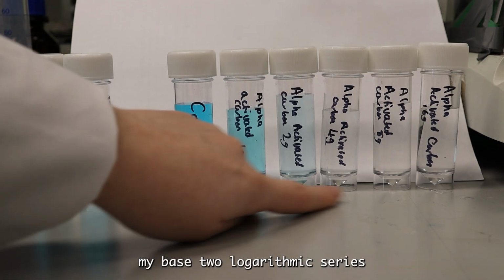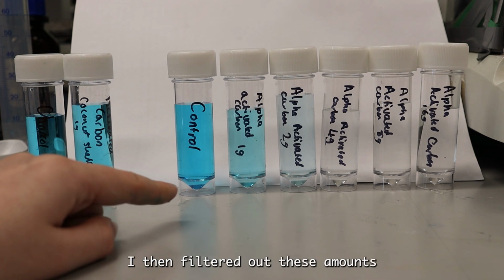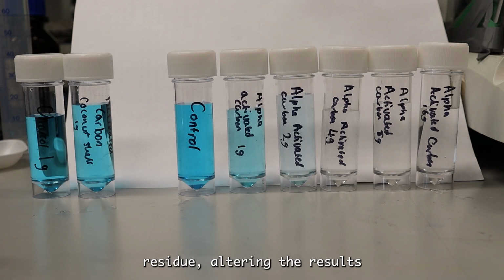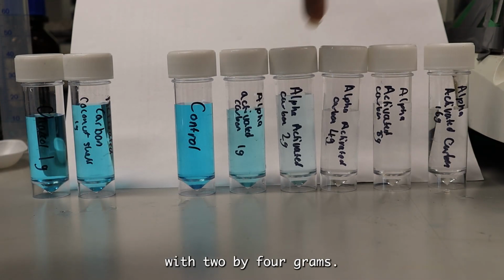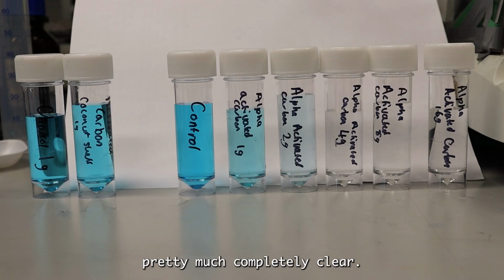This is then my base 2 logarithmic series of how much activated carbon in 100 milliliters of the solution. I then filtered out these amounts so that you don't see any of the actual activated carbon residue altering the results of the colour of the solution. And as you can see here, the more activated carbon, the clearer it is. It gets lighter with 1 and lighter with 2. By 4 grams, it's pretty much completely clear.